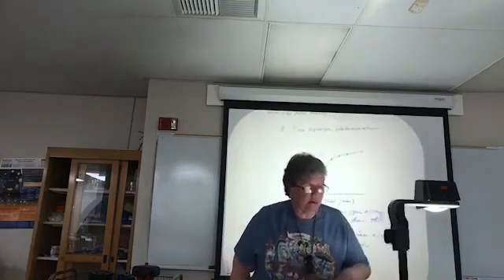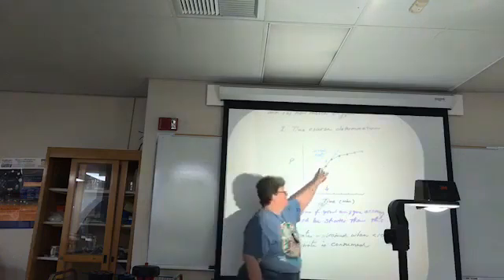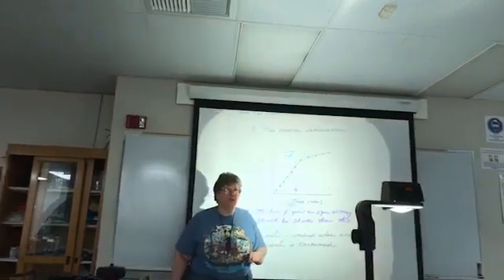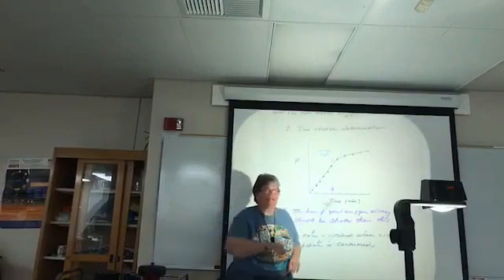And remember, I said that the initial rate's going to slow after about 10% of your substrate is consumed. So when it starts to slow, you may have those data points on your graph, but you're not using those data points for the rate. But it's important to have them on your graph.